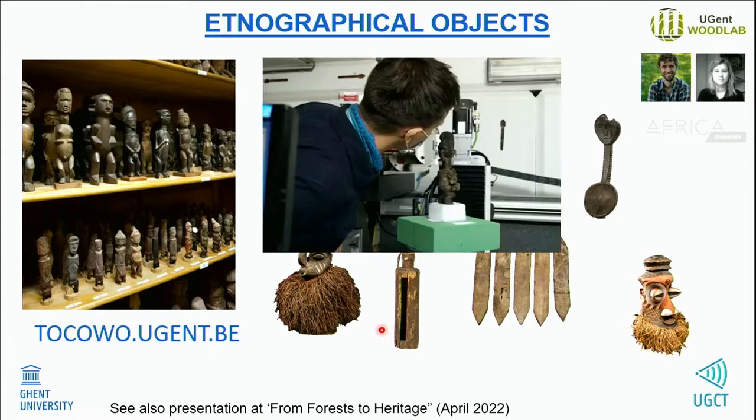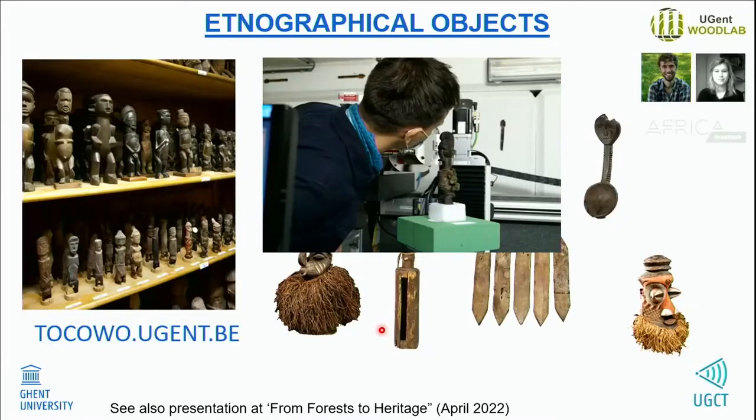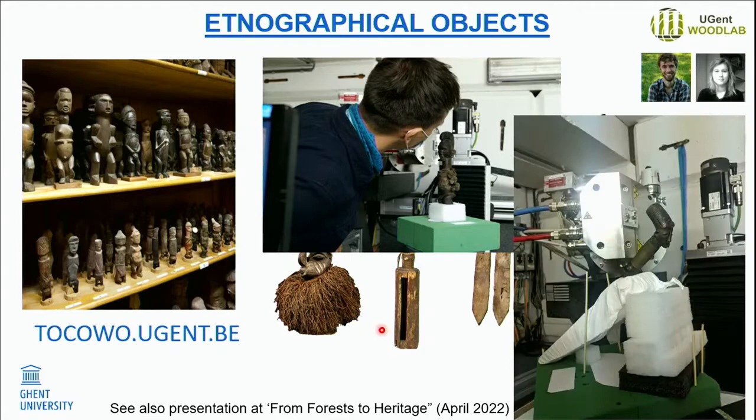Luckily for that, we have a very skilled operator who really is good in mounting objects in a highly scientific way with floral foam. This is still extremely far away from the source to his standards. This one was slightly tighter, mounted to the source. Not really a danger for the source, but for this statue, which is of course quite precious.